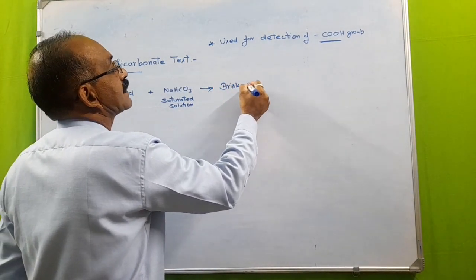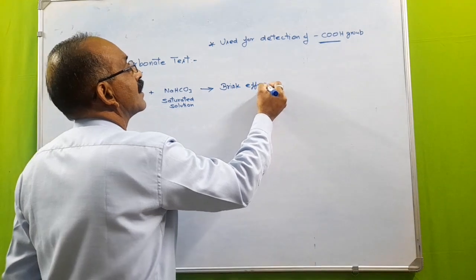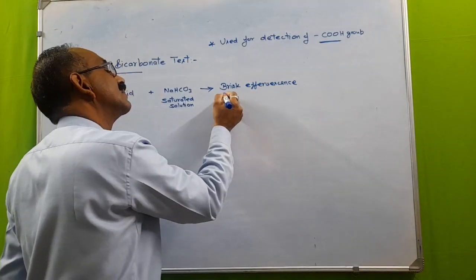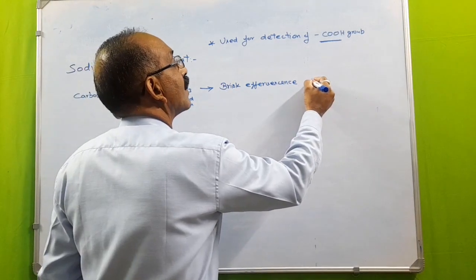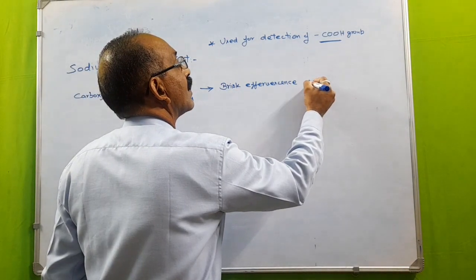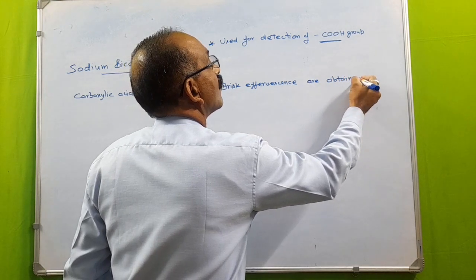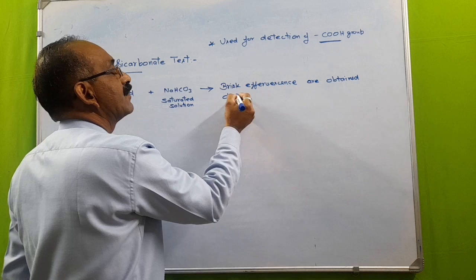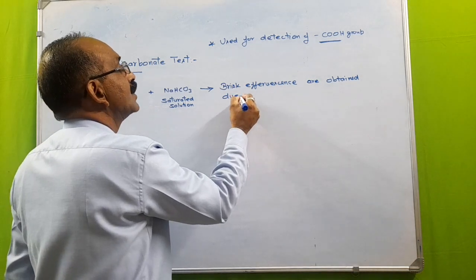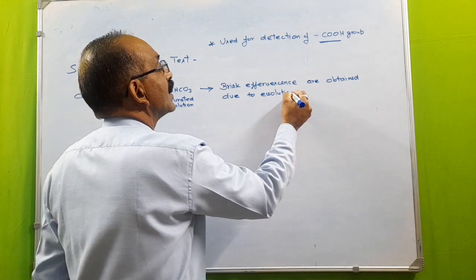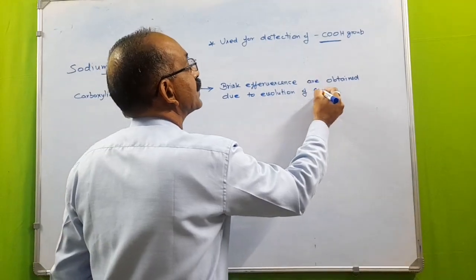Here brisk effervescence occurs. This effervescence is due to evolution of CO2.